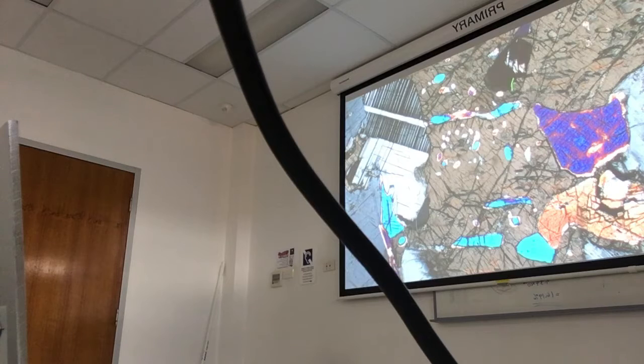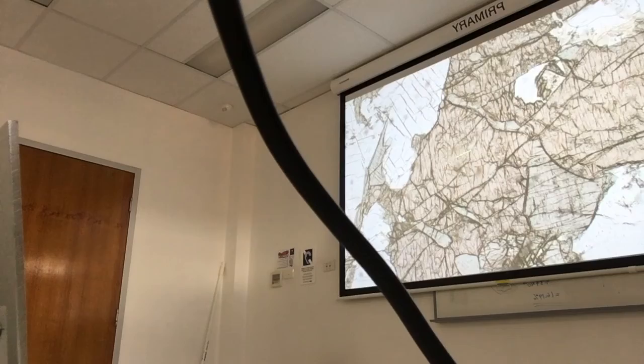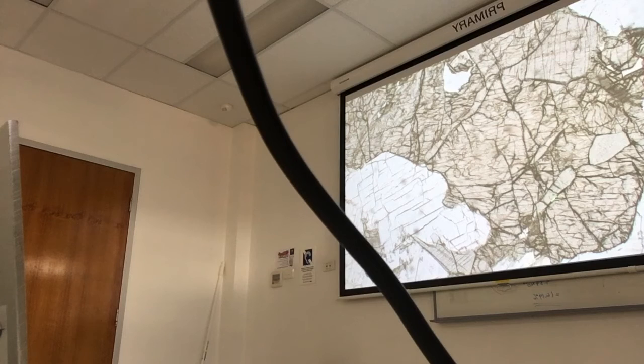So you've got a clinopyroxene grain there, but all this one here, cleavage running through there, that's all orthopyroxene. And it's got exsolution lamellae of clinopyroxene inside it. So what we looked at before was augite with hypersthene exsolution lamellae in it. This is just the complete reverse. Notice there's no twinning in this one. Notice in plain light, this time the host is pleochroic, but the exsolution lamellae aren't pleochroic. So this time you've got augite lamellae inside hypersthene.